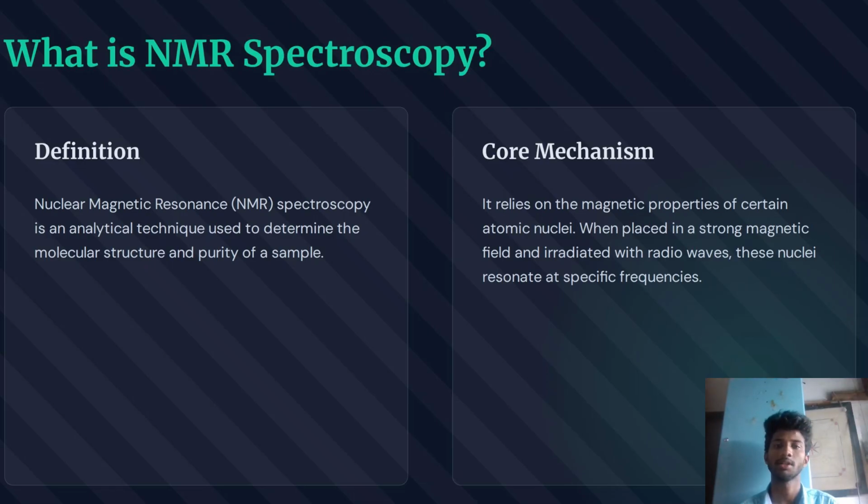Core mechanism. It relies on the magnetic properties of certain atomic nuclei. When placed in a strong magnetic field and irradiated with radio waves, these nuclei resonate at specific frequencies.